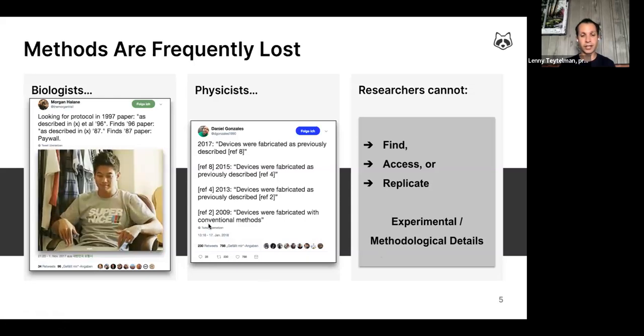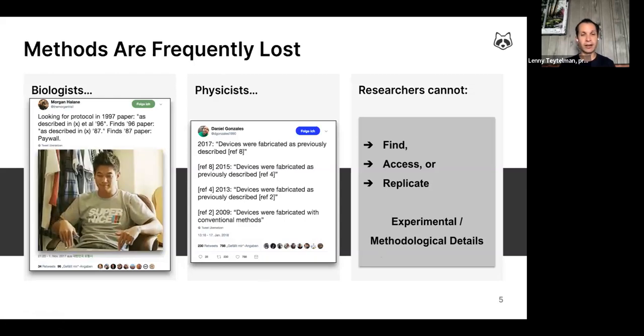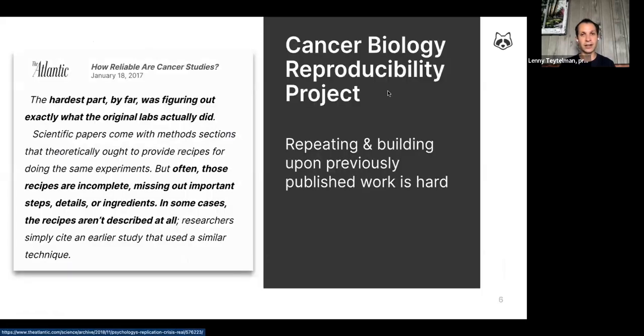And to make it a little bit more quantitative, we like to spend a few minutes discussing the Cancer Biology Reproducibility Project, which was a 2015 $1.5 million initiative of the Center for Open Science and Science Exchange, which chose 50 cancer papers in top journals. And the idea was to independently replicate some of the key experiments and make sure that we can get the same results in a different laboratory. So they set out to do that with 50 papers, and a year or two into it, when the first results were published in eLife, there was a lot of attention to it, a lot of media coverage, and Ed Yong wrote a nice long article about this in The Atlantic.